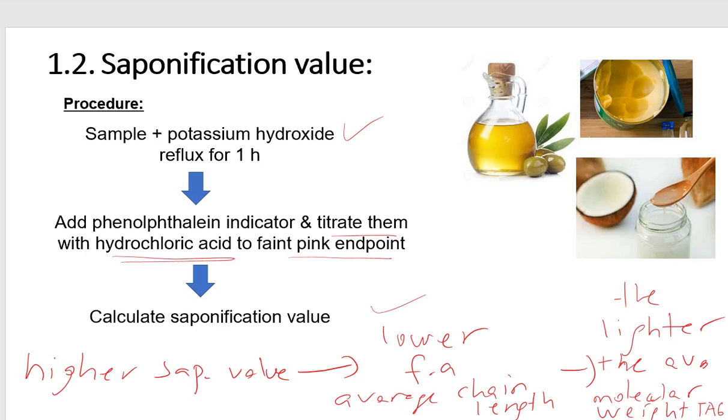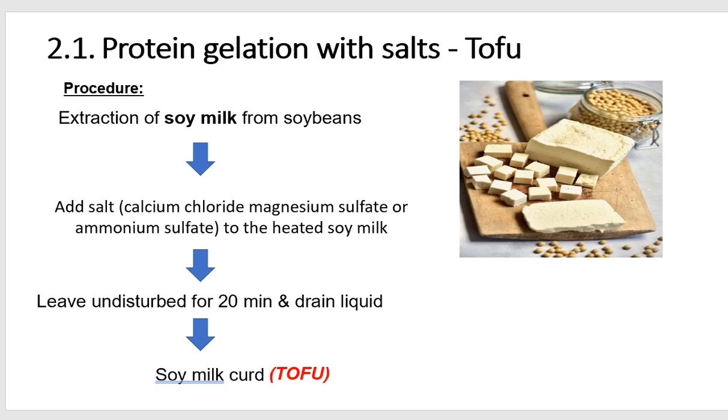Okay, let's continue. So in this part, we are making tofu. Tofu is also known as soy curd.